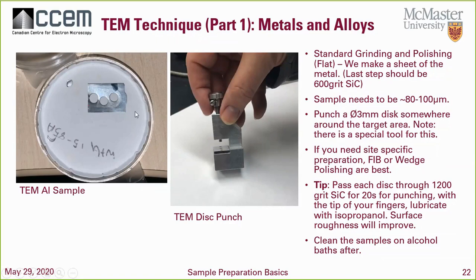But don't forget your rules, right? You don't want to throw out the sample, okay? So what happened to us at the CCM is, we kept the sample, the customer came over and said, I want to look at this area, okay? So it's important that we keep it, we look at the area afterwards, okay? Just because I punched this 3 millimeter piece doesn't mean I'm going to get rid of it, okay?